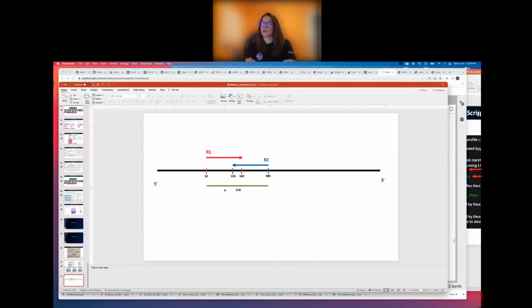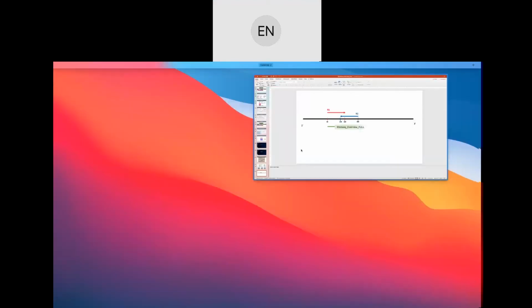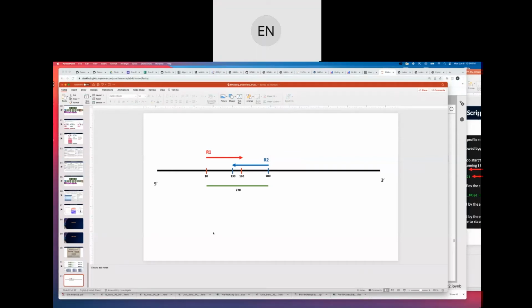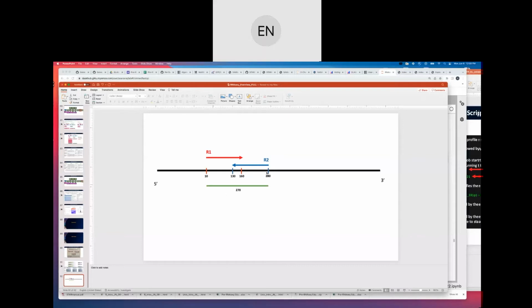So basically this hinges on the fact that you feed the data with the cluster location and say, these two go together, make it work by using this kind of analysis against the reference genome, right? Yeah, it hinges on the fact that you're feeding it the cluster location and saying these two are a pair. And then it finds, I guess, the best solution that matches both of them to a transcript. It finds where each one of them maps to the transcript, and then it tells you the length.